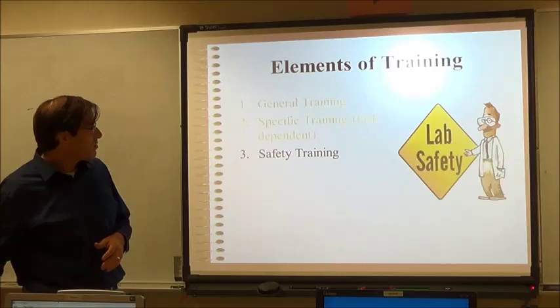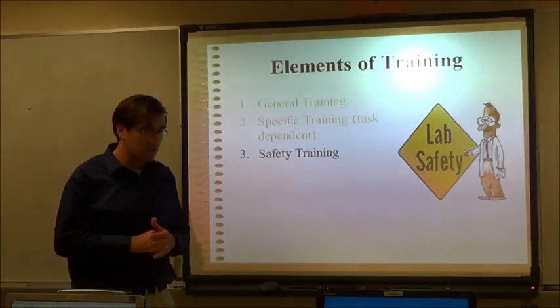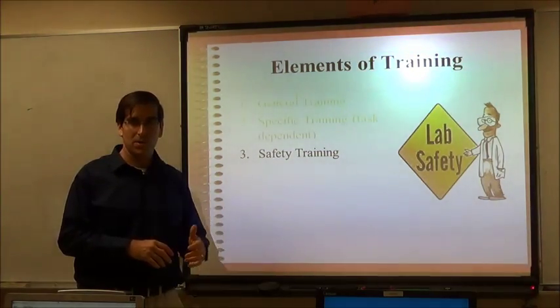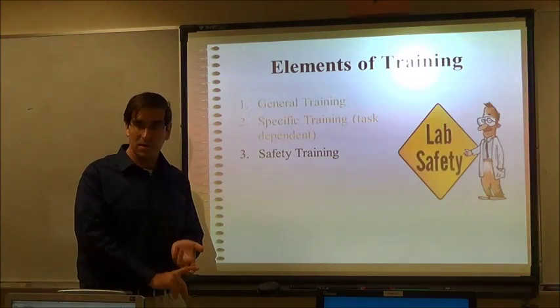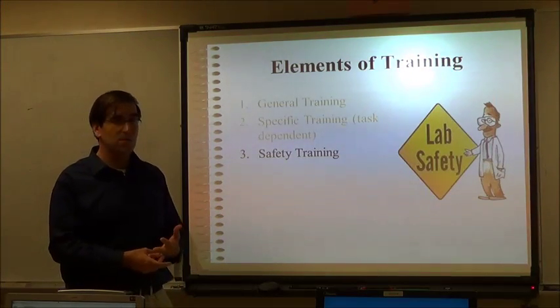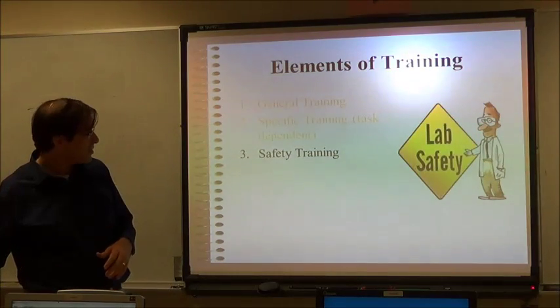Then there's safety training compared to general training. Safety training in this case is the things you need to do to be safe in any laboratory space. So this is not general training, but the actual type of equipment that you need to wear, how you need to conduct yourself within that laboratory space. Things that are applicable specifically here, for instance, at Roxbury Community College, that we want to make sure are implemented.